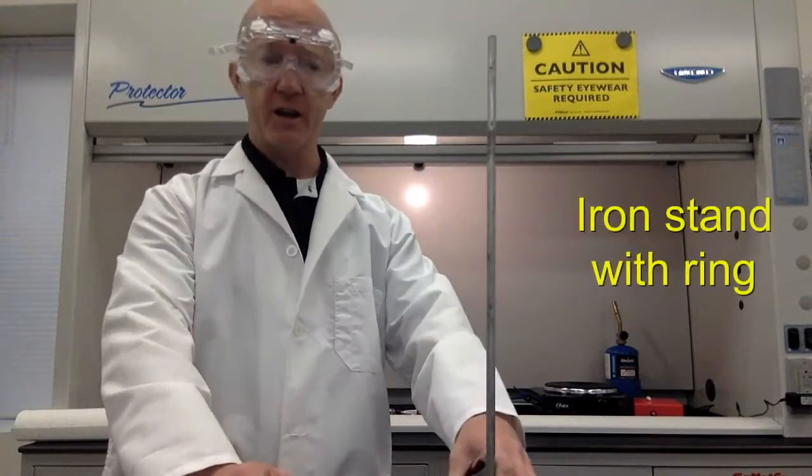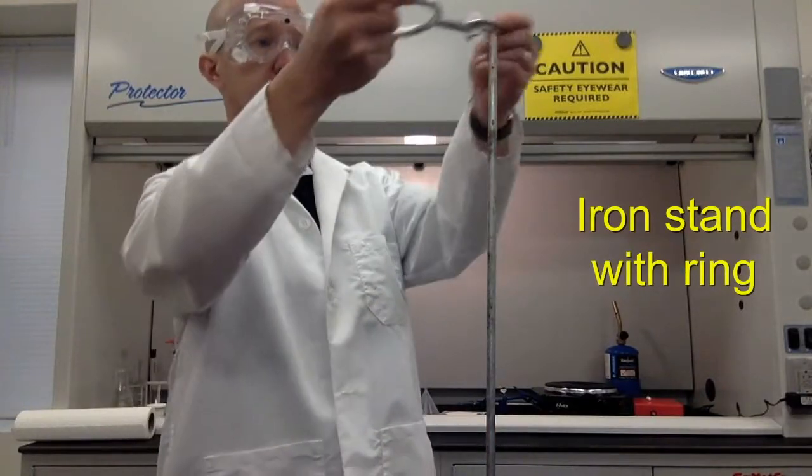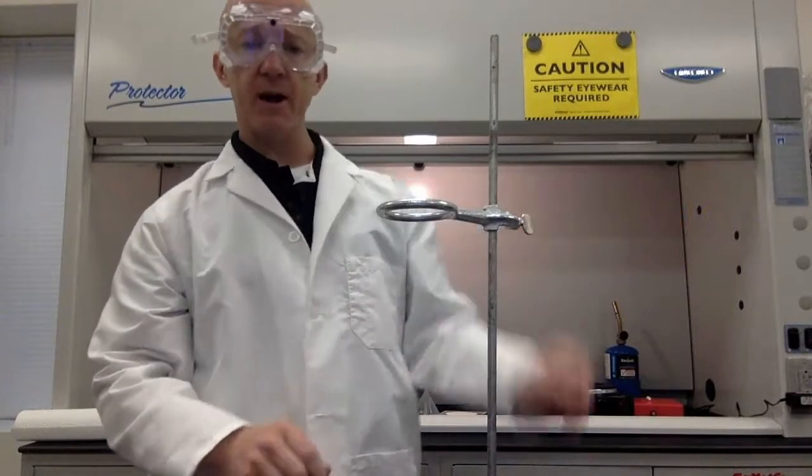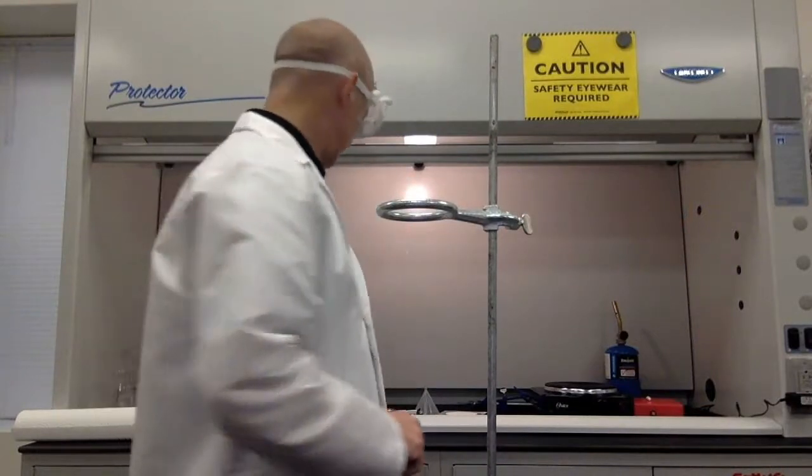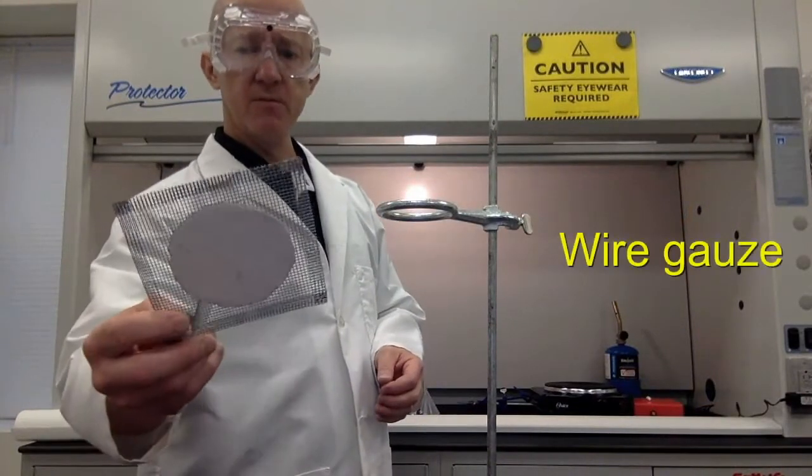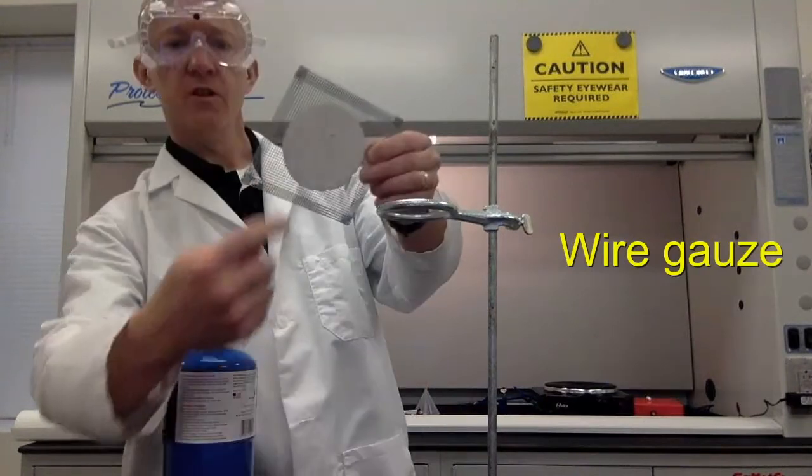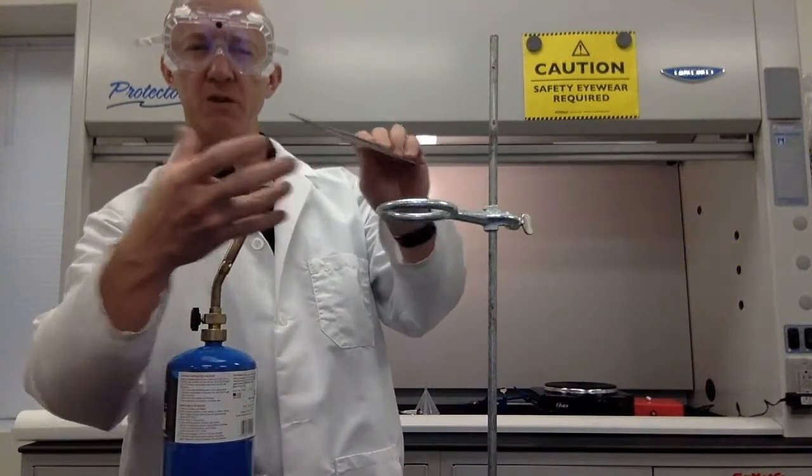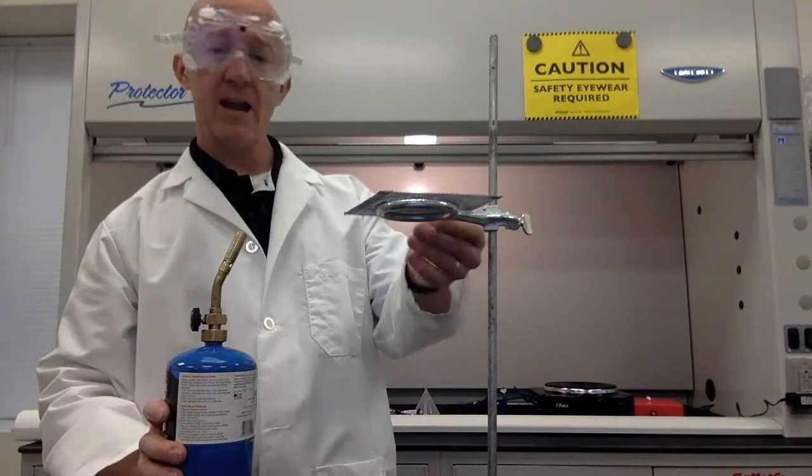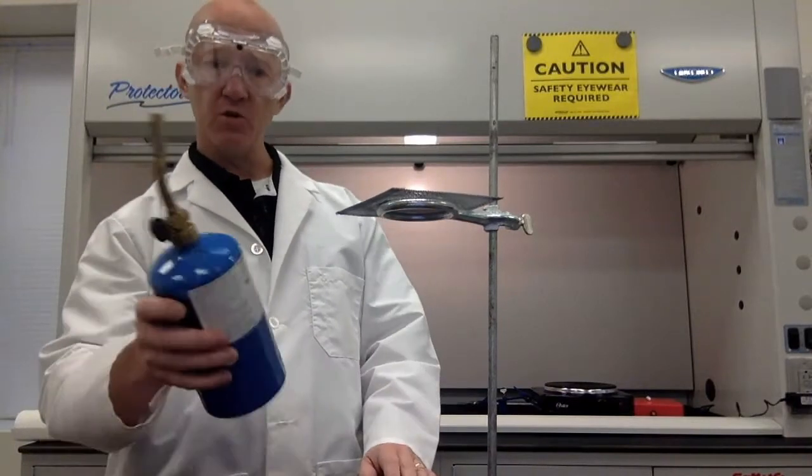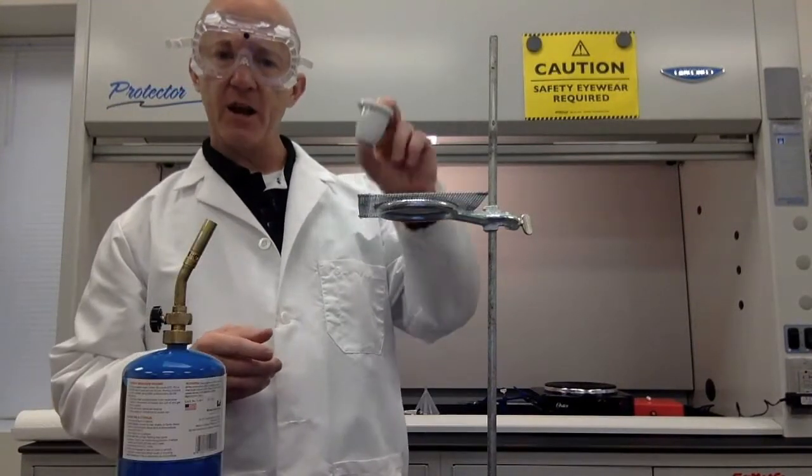This is an iron stand. And this is an iron ring. You simply clamp the iron ring onto the stand like this. And then you might use something like this. This is called wire gauze. This material in the center allows for the heat to be distributed a little more evenly. And it's also fireproof. So we can use things like a torch. Sometimes though, if we're heating a crucible, the wire gauze doesn't exactly do what we need it to do.